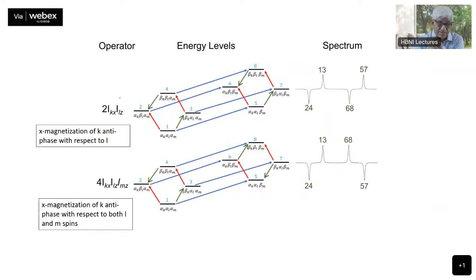Okay. So the K spin magnetizations are the green ones: 1-3, 2-4 and 5-7, 6-8. Notice here now, these two I put in opposite directions. One is absorptive, the other one is emissive. This comes down. Similarly, this is absorptive and this is emissive, comes down. Now, if I represent 1-3 as positive, the 2-4 will be negative.